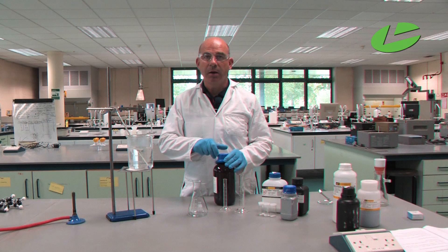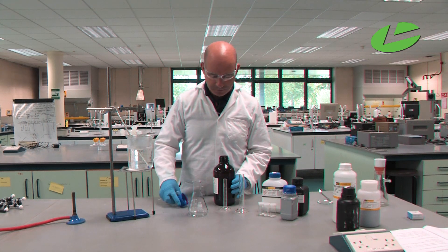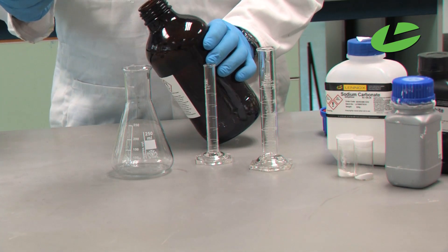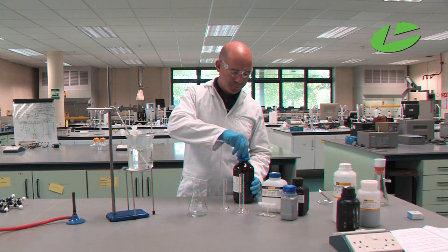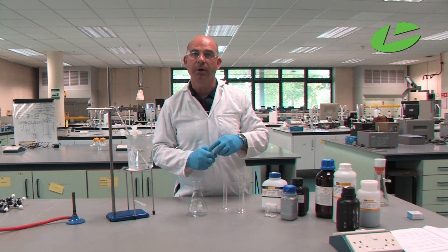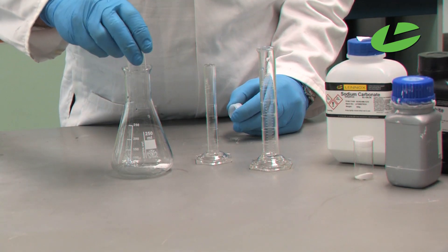To start the reaction, I'm going to add one milliliter of benzyl alcohol into my conical flask using a dropper. That's one milliliter of benzyl alcohol. I'm then adding half a gram of anhydrous sodium carbonate, which is pre-weighed in these sample vials.